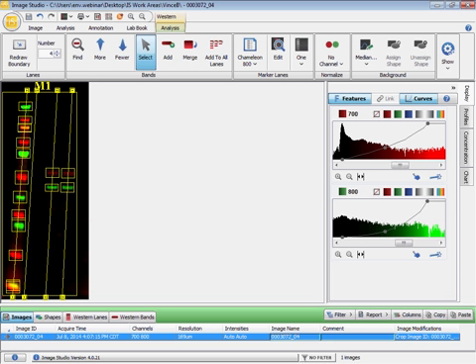In this example, there are target bands in both the 700 and 800 channels to be sized. And because I set up this plot, I happen to know that the molecular weight of the bands in the 700 channel is approximately 55 kilodaltons, and the molecular weight of the bands in the 800 channel is approximately 45 kilodaltons.